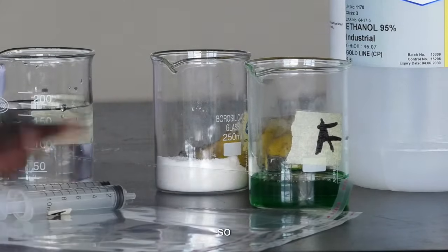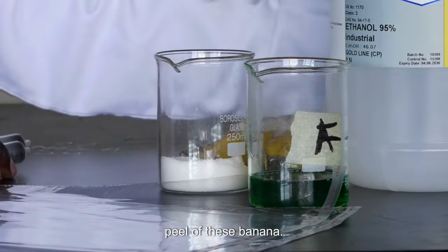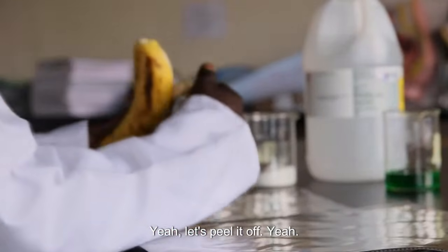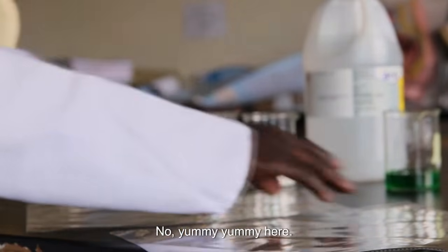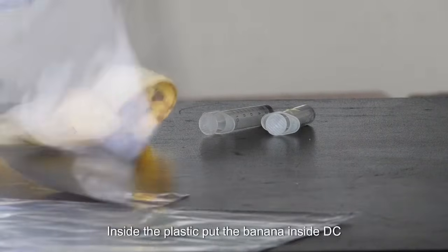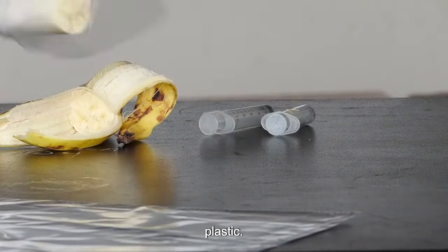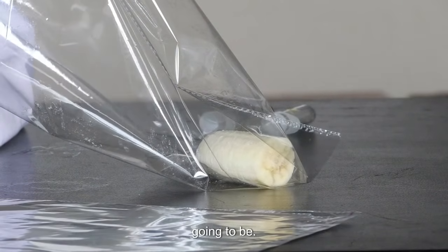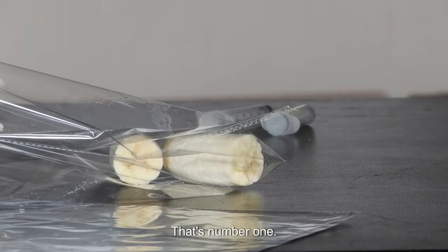So number one, what you need to do is peel off this banana. Yeah, let's peel it off. It's not for eating. Some people will be saying yummy yummy, but no yummy yummy here. So we put the banana inside the plastic. Put the banana inside this plastic. It depends on how many students you have. So that's my banana. That's number one.